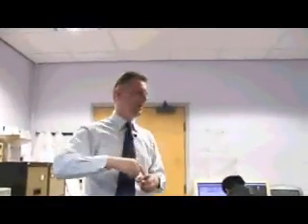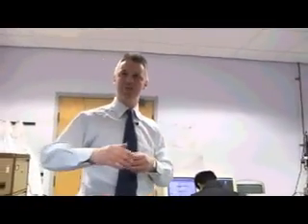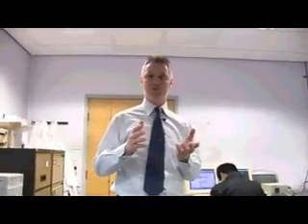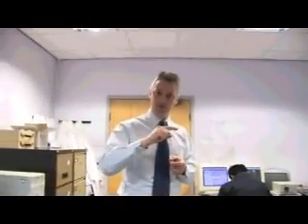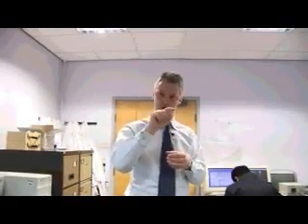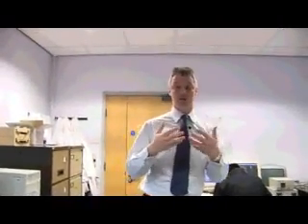Whenever you speak to anyone in our area, they're always doing this and saying particles interacting. And when I show you how the microscopes work, basically it really is just a very sharp needle on, it's kind of like an old-fashioned record player, if people can remember record players, where you had an arm and a needle. The only thing about this microscope is that the arm is absolutely tiny. It's about a fraction of a millimetre in length, and the little point now basically has a single atom on the end of it. So when we run that needle over the surface, the image we get, the profile we get, is because that needle is so sharp, we can actually see, for example, things like single proteins.